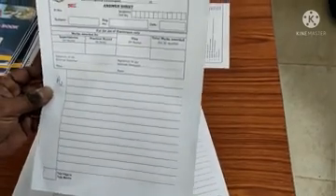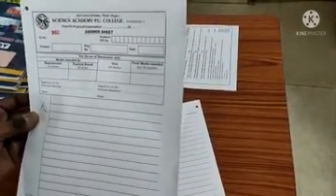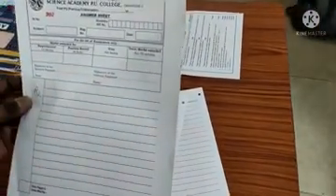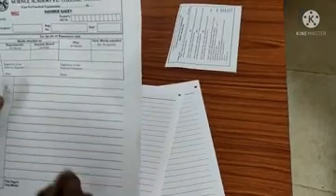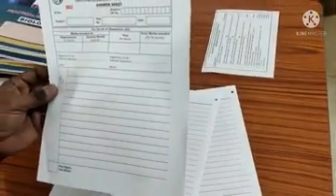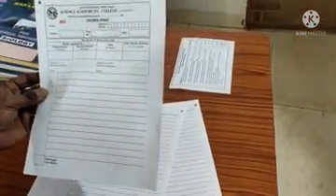For the first question I have the A2 question. A2 means the preparation of the slide of pollen tube growth on stigma. I have to prepare the slide, write whatever they have asked, focus the slide in the microscope, and get the signature from the external examiner only. These are the aspects with respect to this answer sheet.